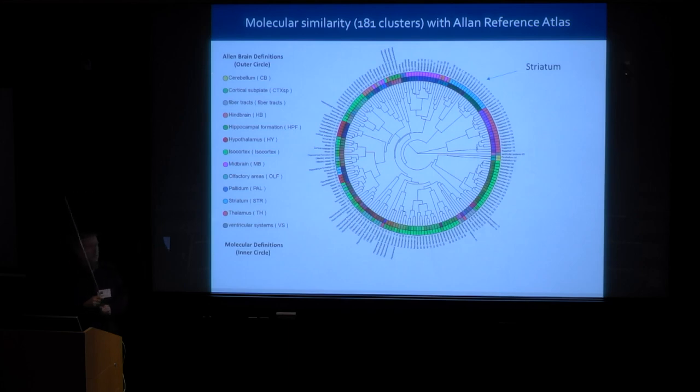Yeah, I don't really follow what you mean. Sometimes you see some expression patterns that cross from the cortex to, like, hippocampus, some RNAs expressing, not necessarily strictly bounded by the regions. Yeah, I think in many of those connectivity things, you have to have a higher density of the measurement to be able to pin down a single neuron that connects different parts of the brain. So obviously that would be fantastic. As I said early on, the sensitivity of these subcellular arrays is not there yet, so that will only look for the top biomarkers. But I think that's a super good potential to do in the future.